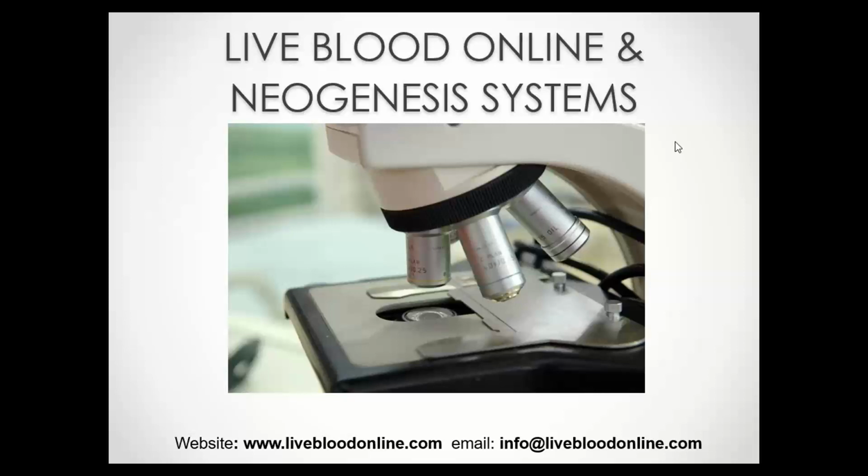And how long does it take to become proficient in live blood analysis? Well, becoming proficient requires a good knowledge of the theory, and also being comfortable and confident with the practical aspects, in other words, taking and preparing blood samples and using the various settings on the microscope to view those samples.